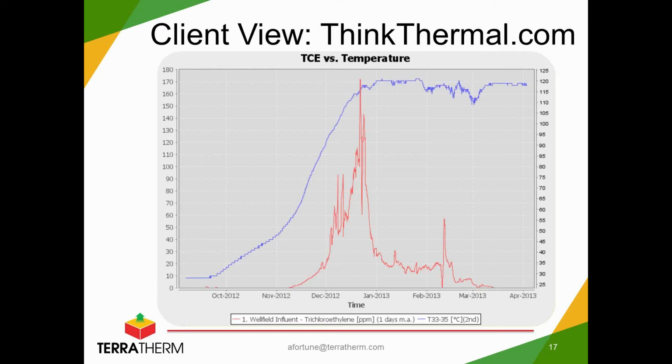Having the FTIR monitor the stack real-time, 24/7, gave everyone that sense of comfort that our remediation system was not emitting anything to the environment. It also allowed folks to monitor things if there were odor complaints or anything of that nature.